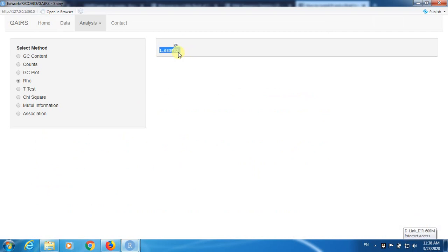Here this is the GC content. I don't think this is underrepresented, and this is overrepresented. It seems that GC content across the gene sequence is not a rare thing, and it is thickly constructed, kind of thing.